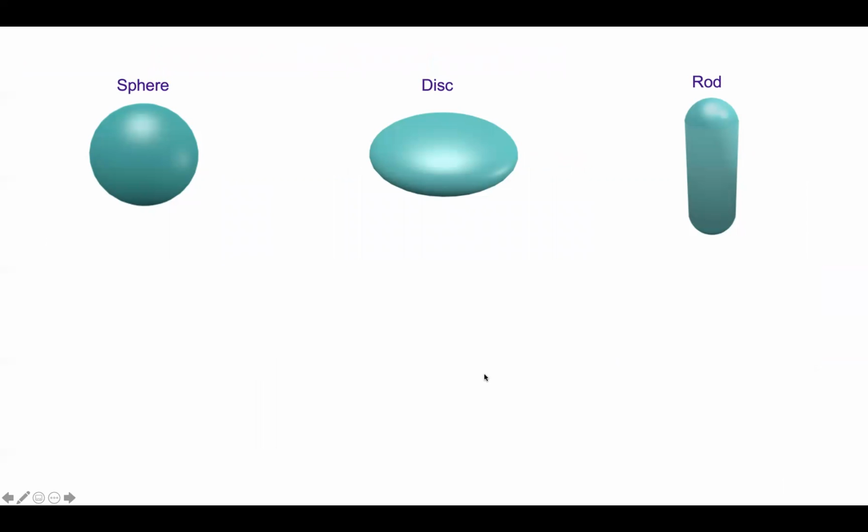Let us move on. What if we go to even higher structures? Single particle reconstruction applies only to biological particles because they are atomically precise, they have better symmetric structures, and they often have repeat units which are the same. Therefore, it is easier. As we move to synthetic materials, metal nanoparticles, and other assembled structures, we go to more polydispersed, different sizes and shapes, and the question is how to study those non-uniform structures.